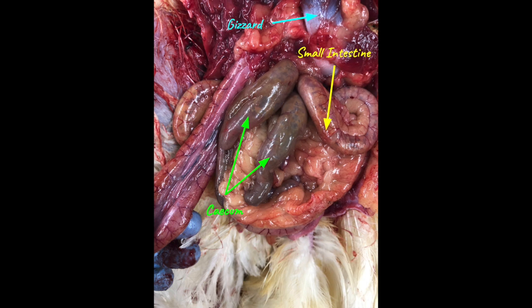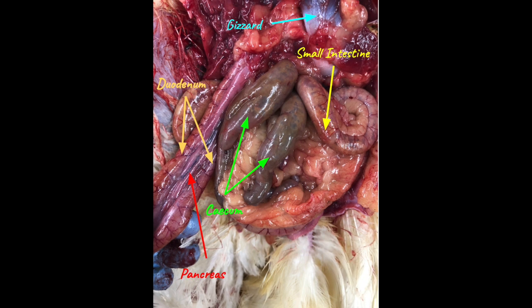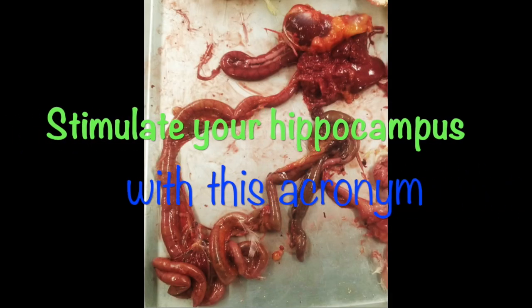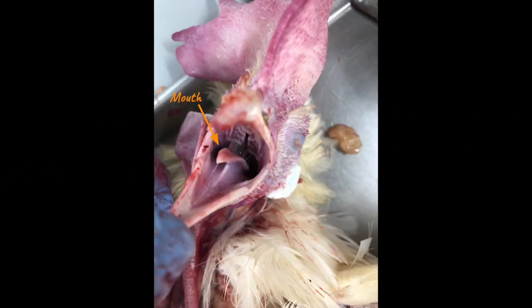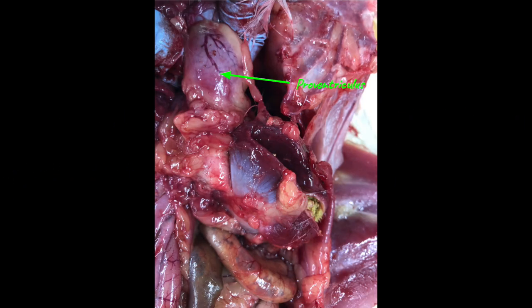The intestinal ceca contain bacteria important for digestion of plant cellulose and water reabsorption. The pancreas, within the duodenal loop of the small intestine, secretes digestive enzymes. The large intestine is where the final water reabsorption occurs. Finally, the cloaca is where fecal matter is collected and then released.